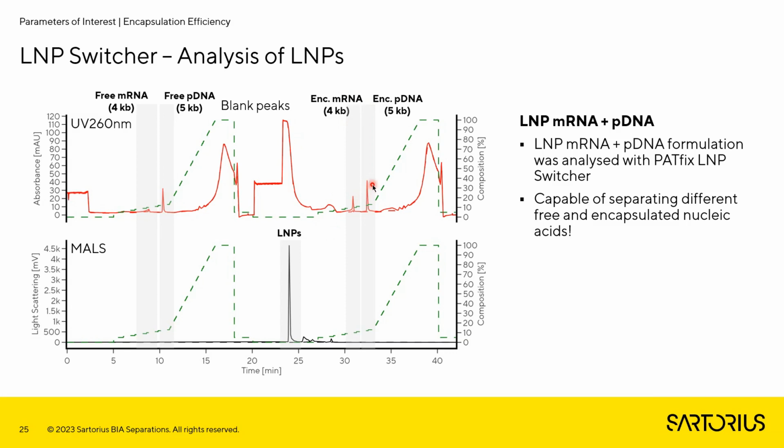So using this system, we can also determine the amounts of individual nucleic acids, free as well as encapsulated, in co-encapsulated LNPs. And also here in the MALS, we have a quite nice response where LNPs are eluting from the column.